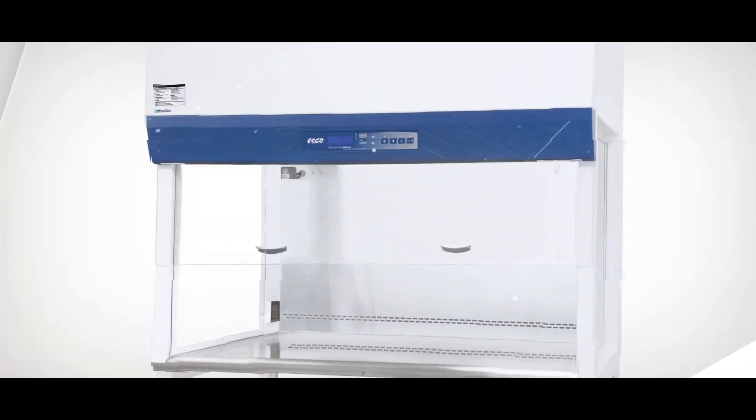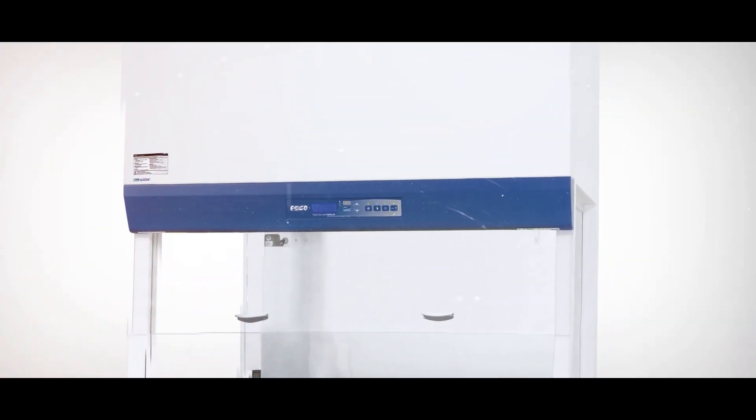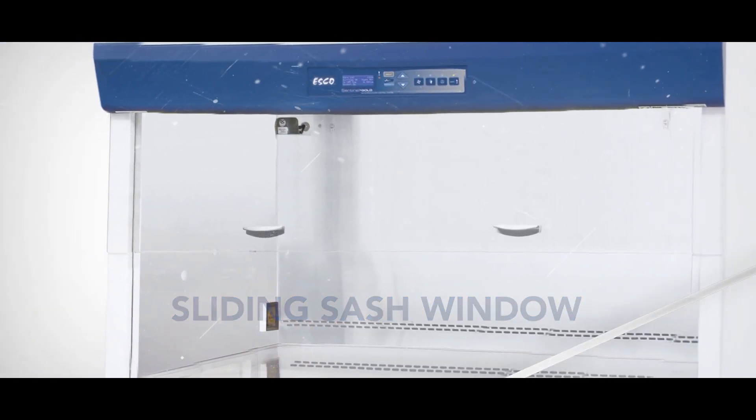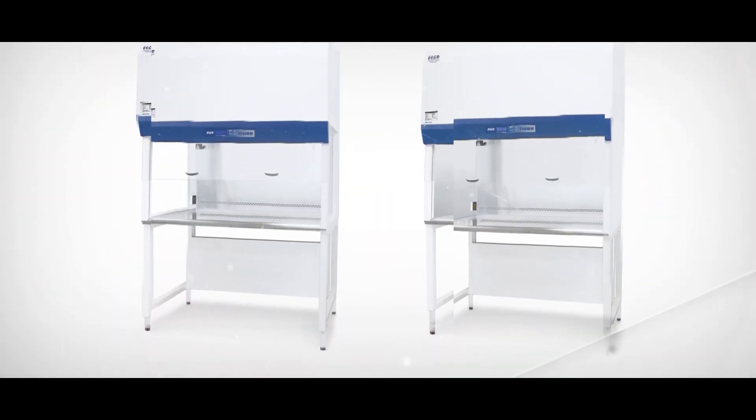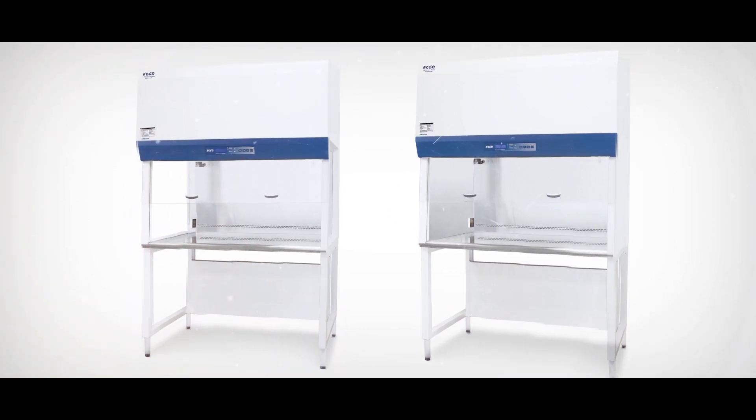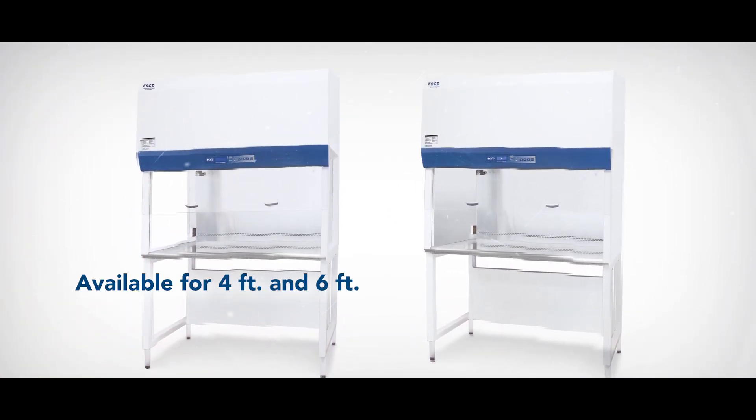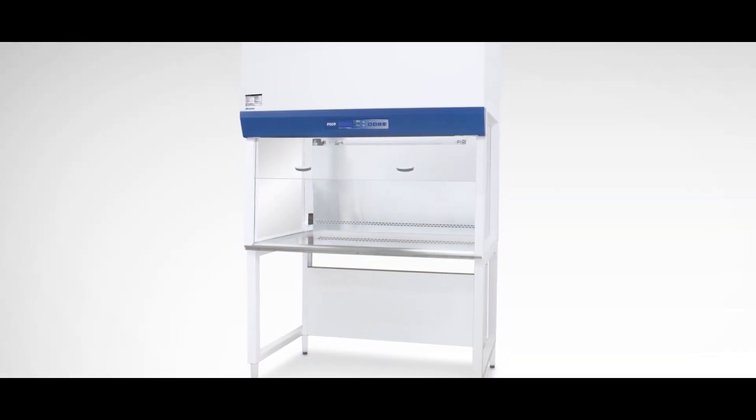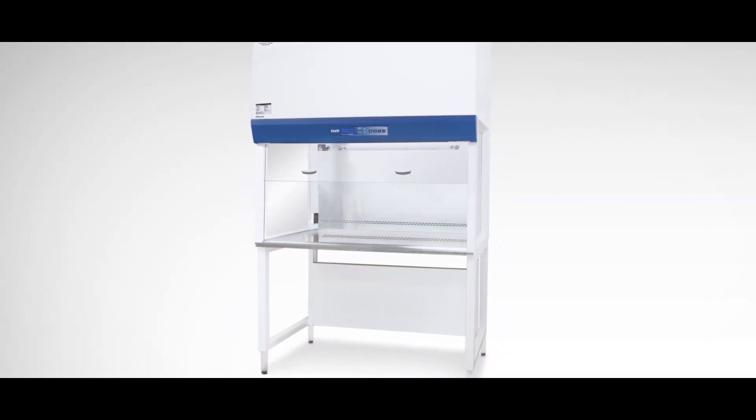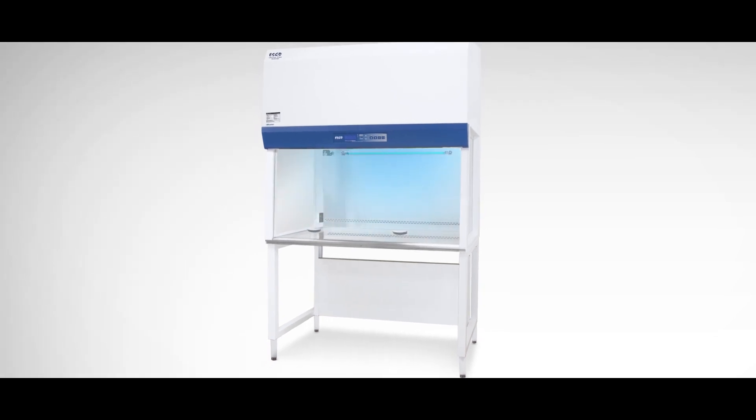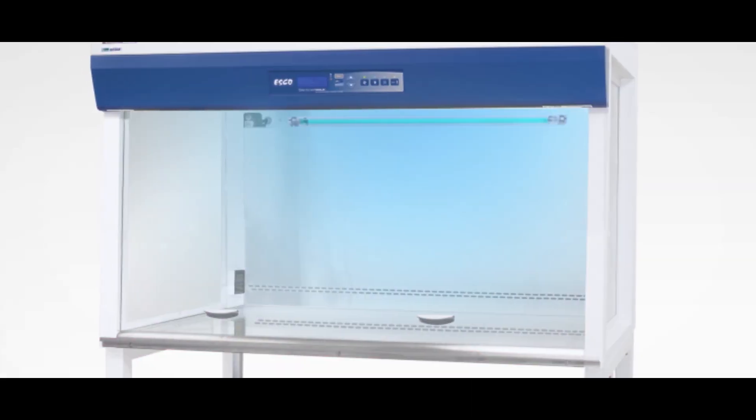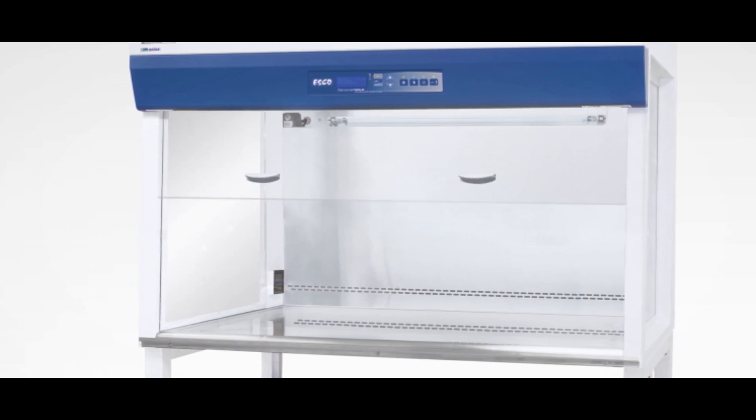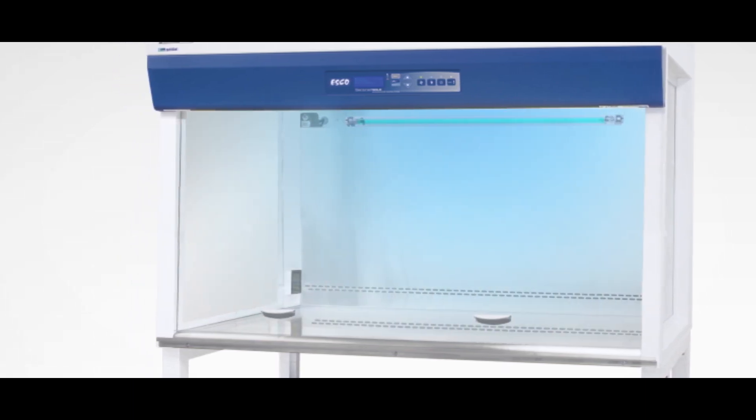Esco now offers the option of a sliding sash window for the Airstream vertical laminar flow cabinet. This new feature is available for glass and stainless steel sidewalls in both 4-foot and 6-foot sizes. The new models provide the convenience of a manual sliding sash window without needing to order a front cover for UV protection, and simply sliding the sash window activates the UV light.